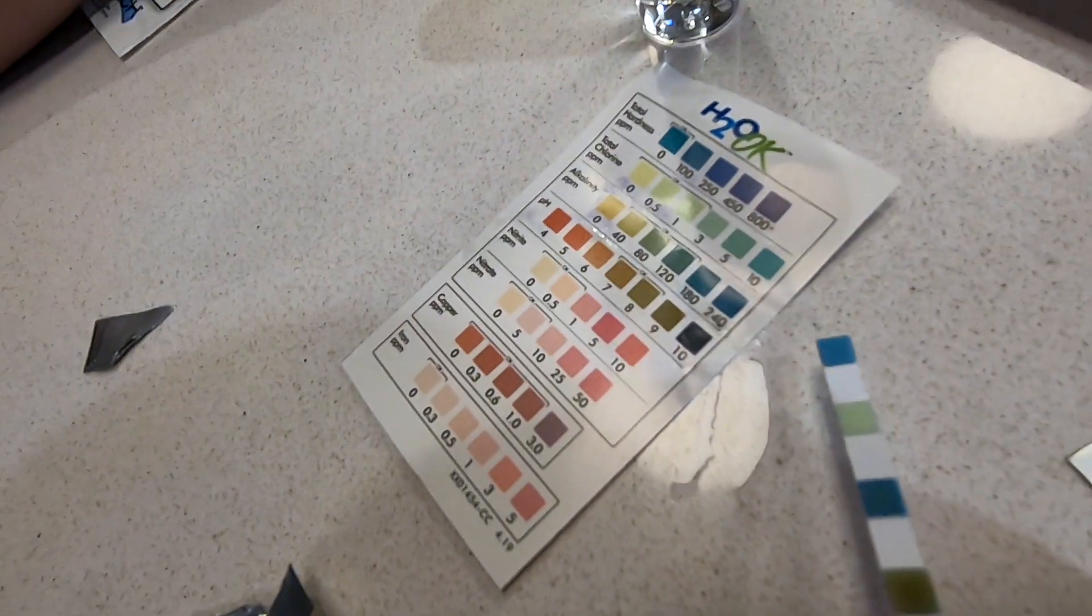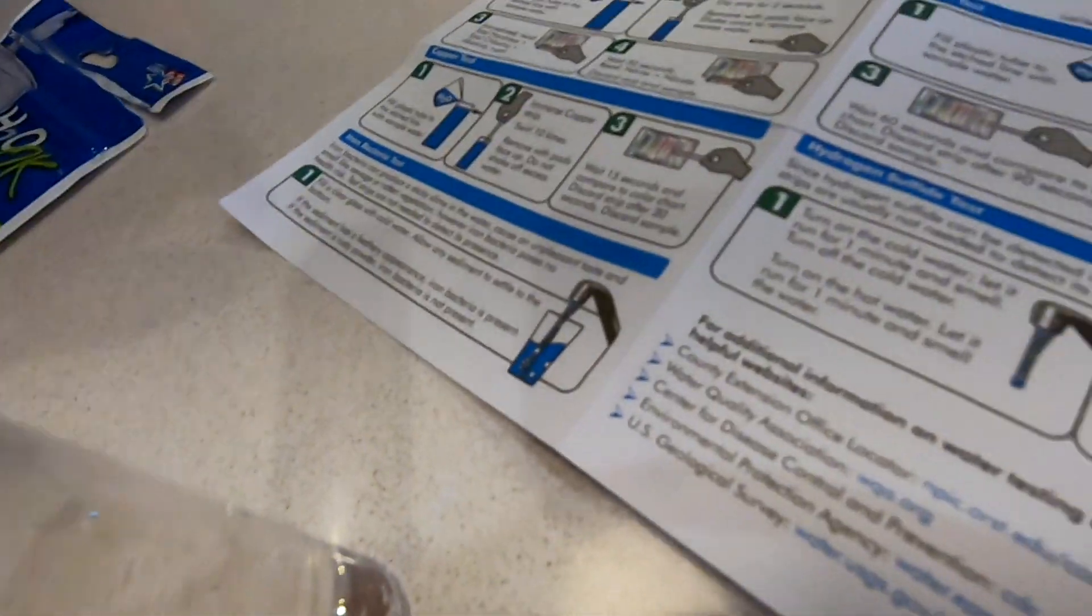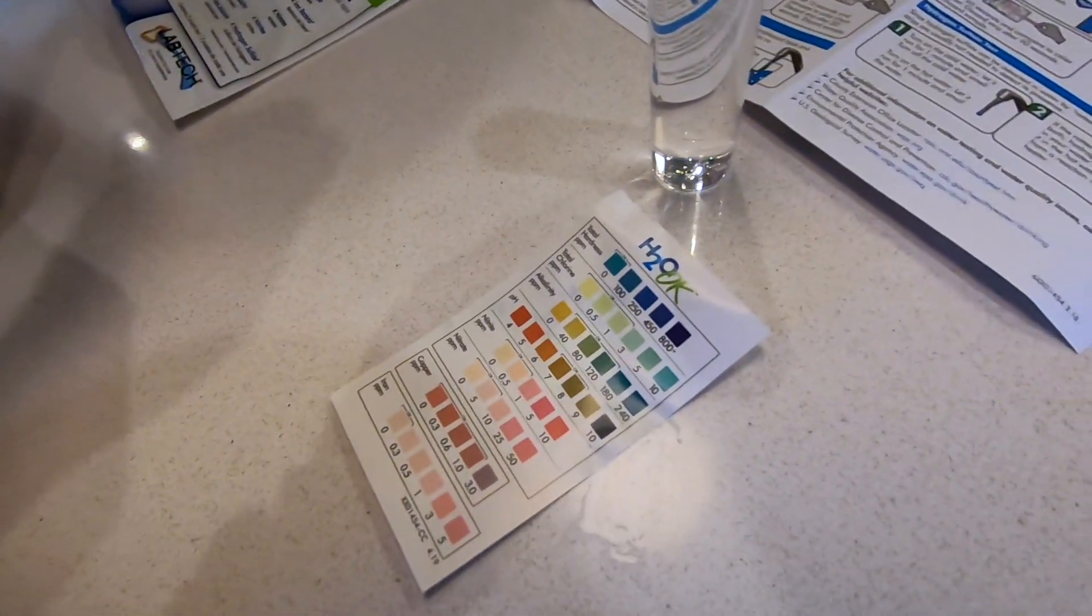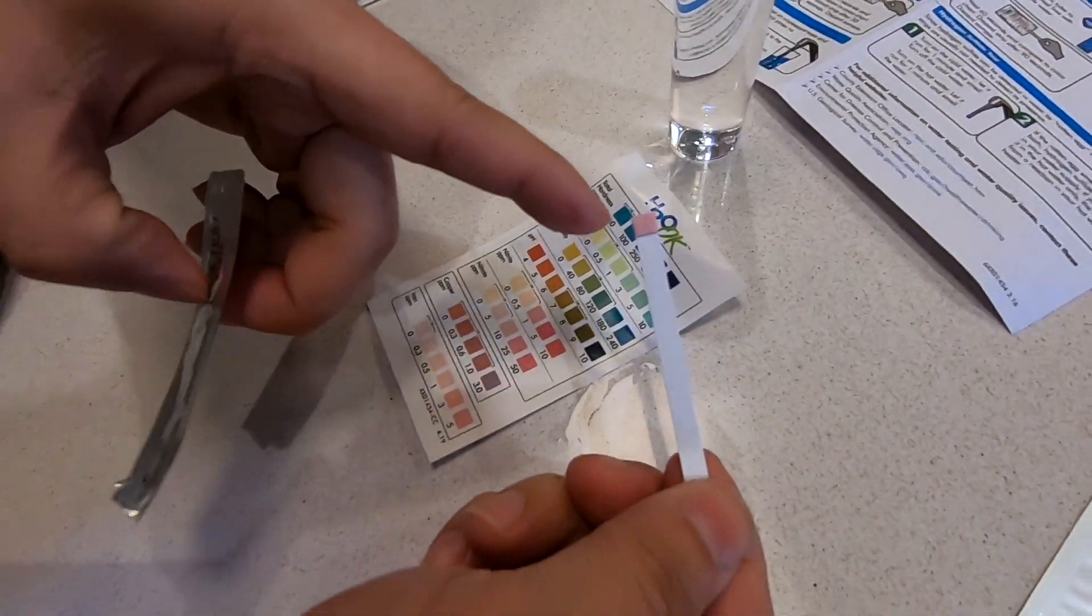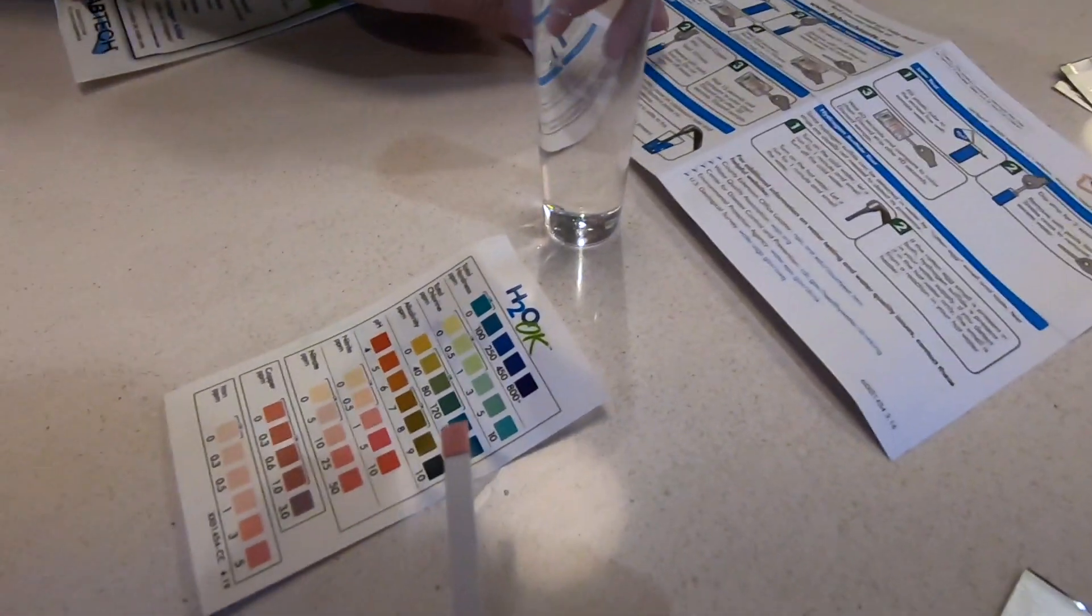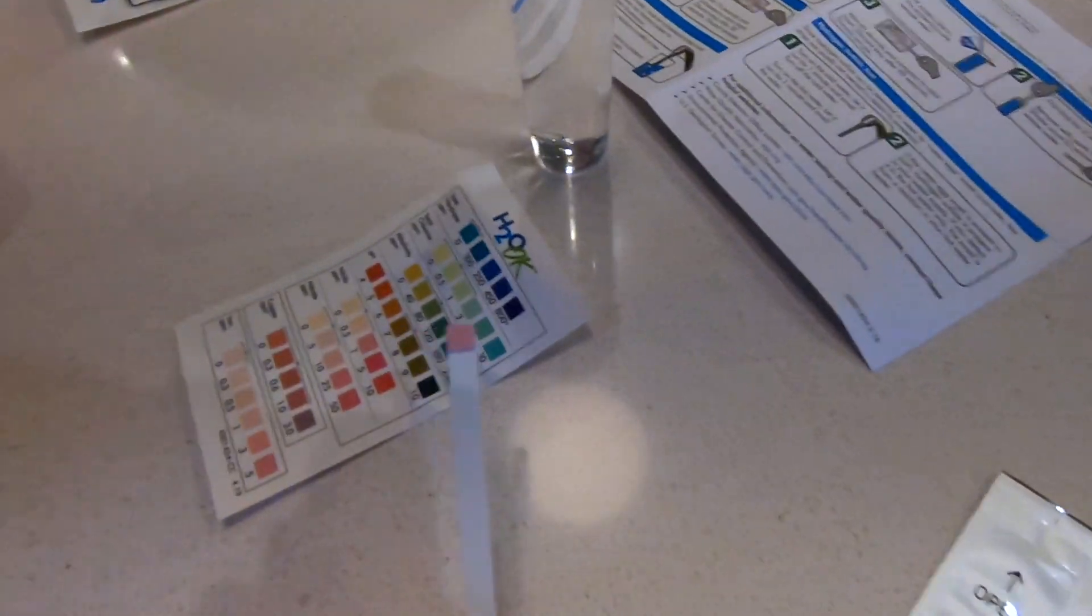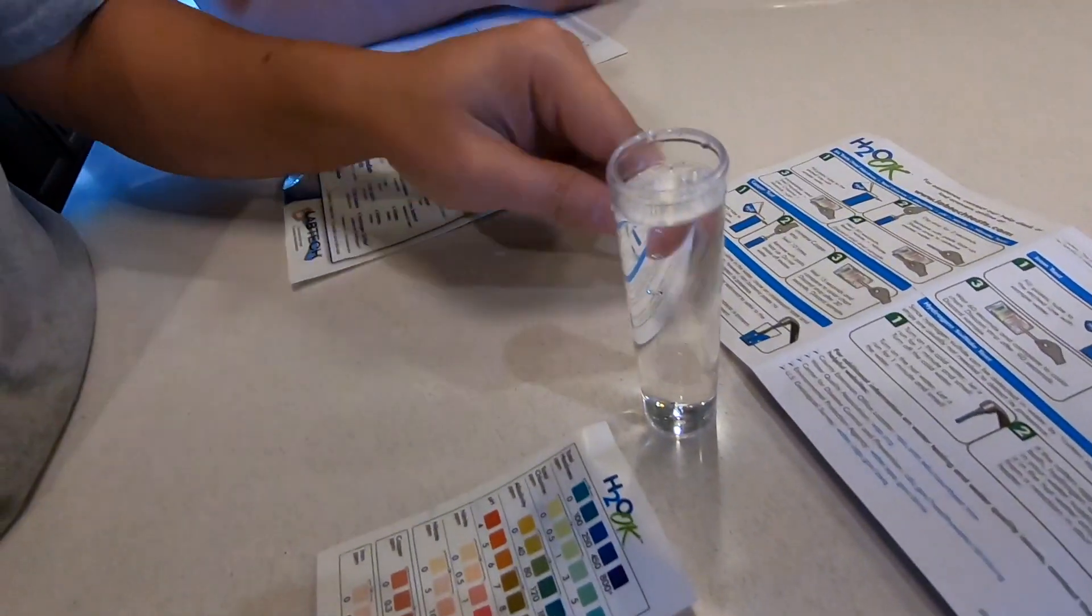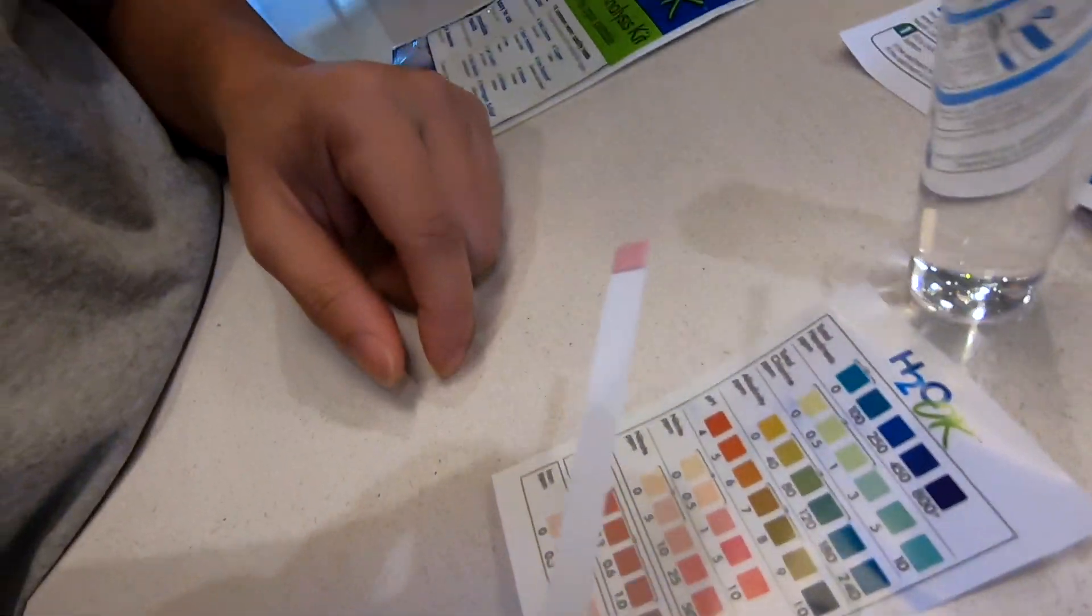Let's do the copper test next. In the copper test there's only one testing pad. The instruction says put it in the water, swirl 10 times, remove the pad facing up, do not shake it, and wait 15 seconds to compare the color to this color chart here.